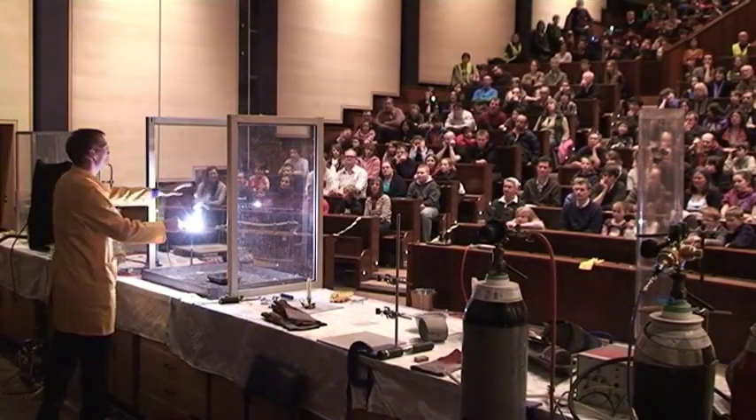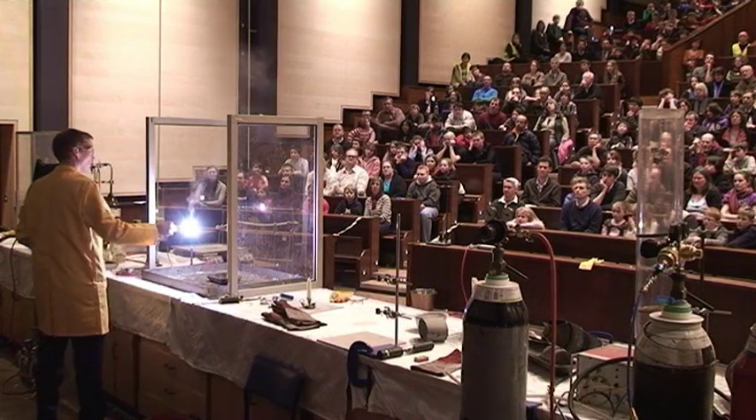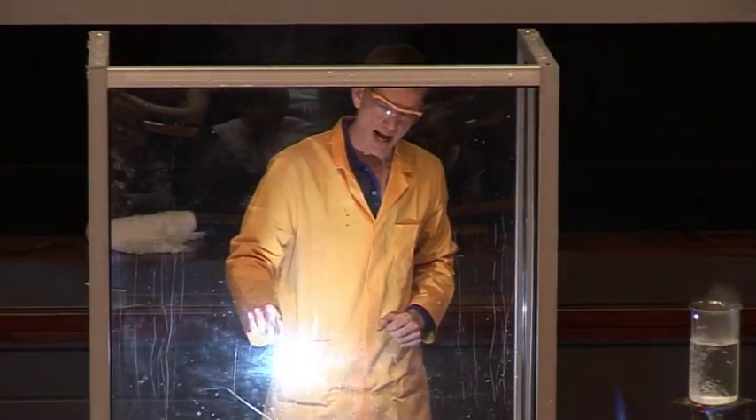Lights back up for a moment please. You can see the smoke that's being formed here. This is magnesium oxide that's formed during this chemical reaction as the magnesium combines with the oxygen from the air.